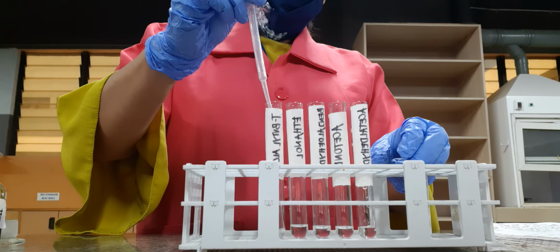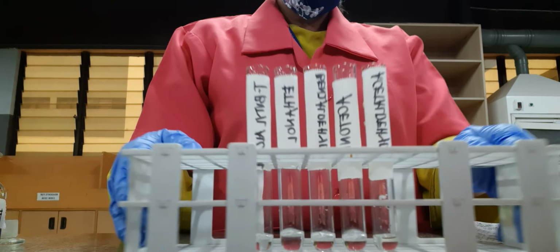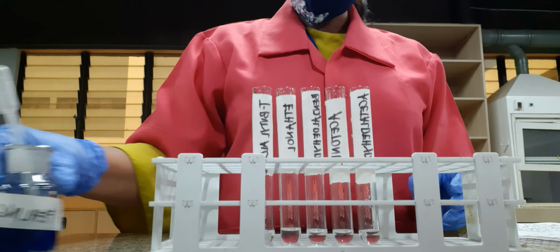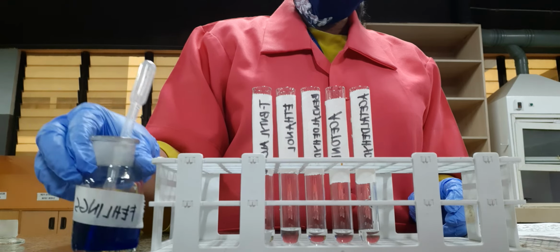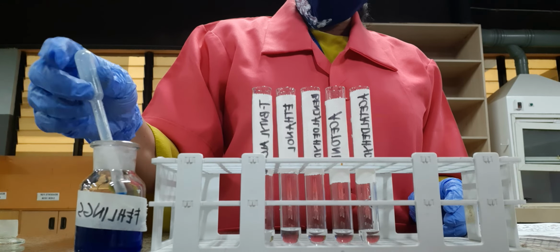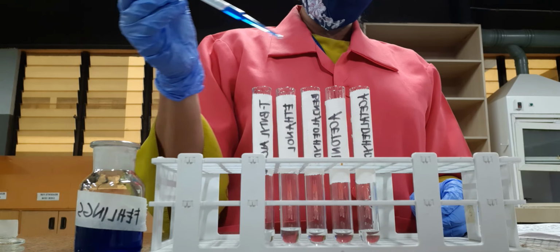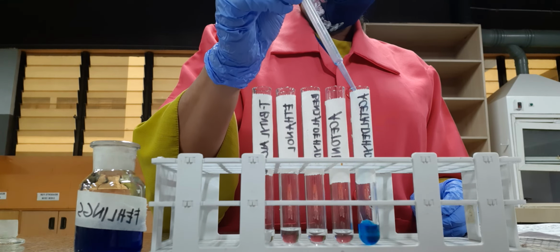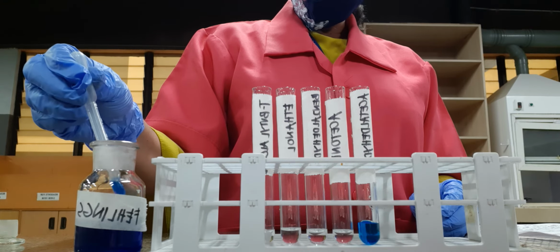Okay? So, take note of the color development once it has reacted with our Fehling's reagent. Okay? Once again, our Fehling's reagent is a cupric ion. Okay? So, take note. Okay? That is acetaldehyde.